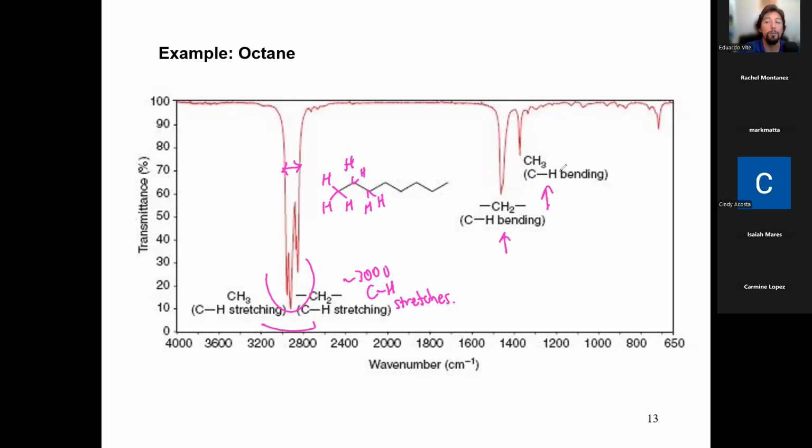I'm going to be honest with you, we don't usually know, unless the molecule is simple, which ones they are specifically. We don't actually need all the signals. We just need to look for the important ones. So at some point, there's going to be more signals, and you might get overwhelmed. You'll be like, oh, how do I know this is a CH bending? Sometimes you don't. And if you don't know, you don't say that you do. You just say, I don't know.